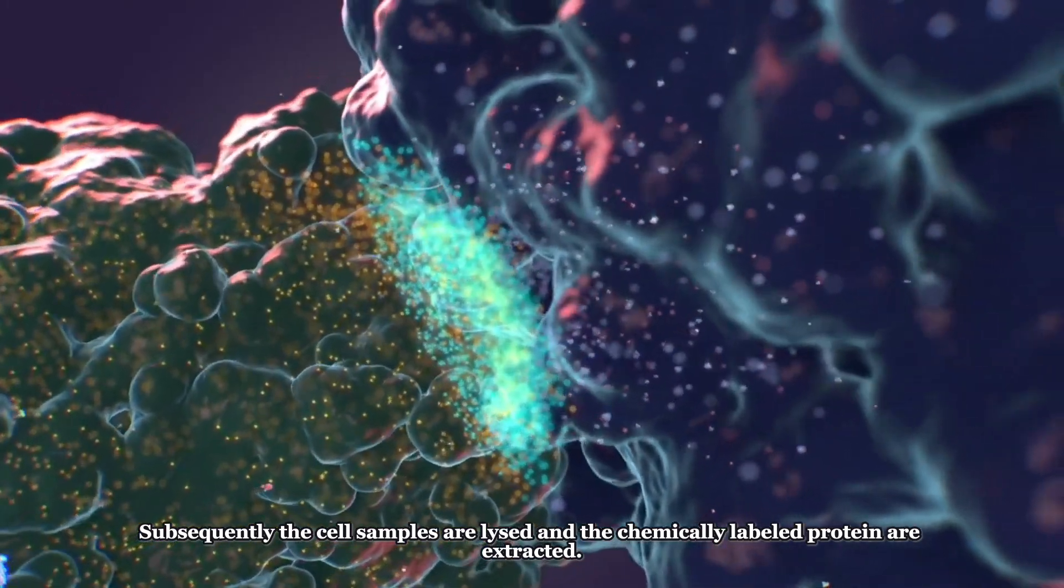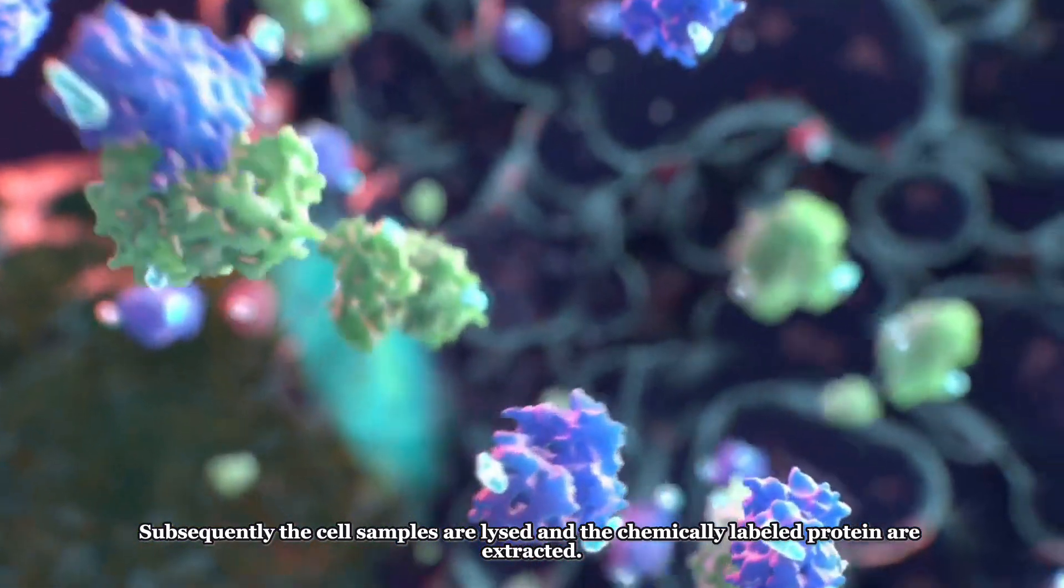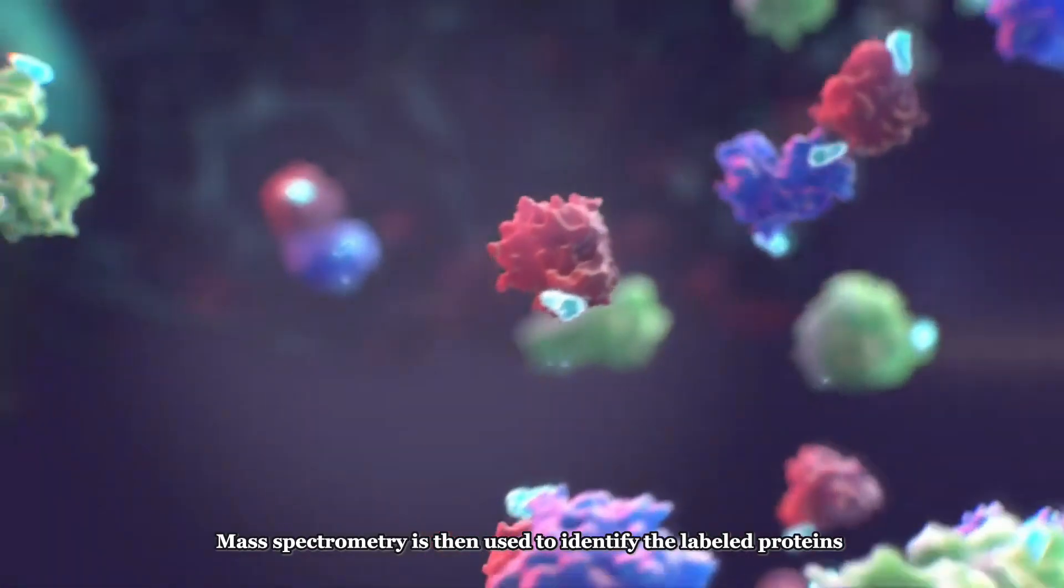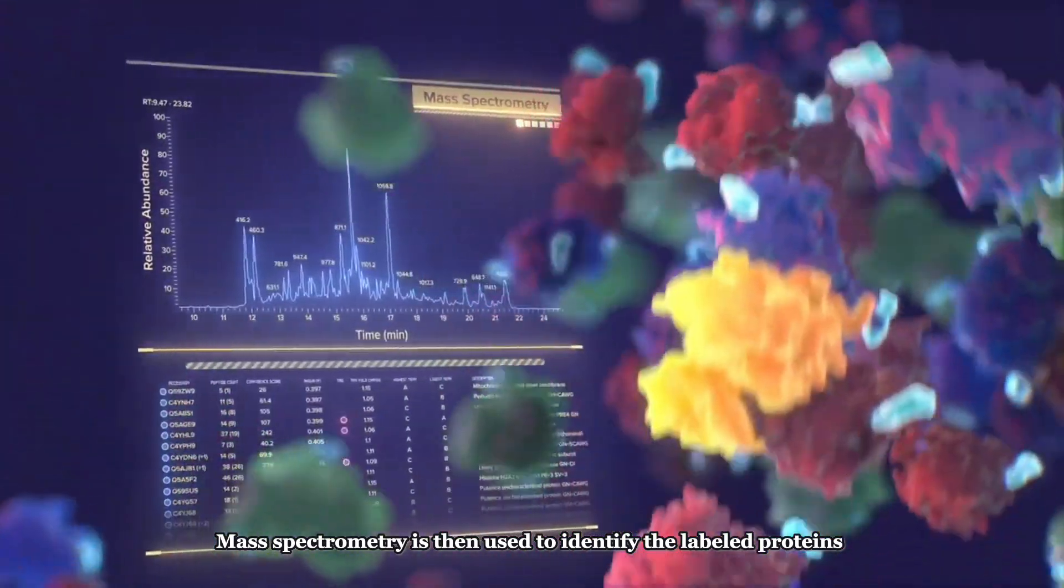Subsequently, the cell samples are lysed and the chemically labeled proteins are extracted. Mass spectrometry is then used to identify the labeled proteins.